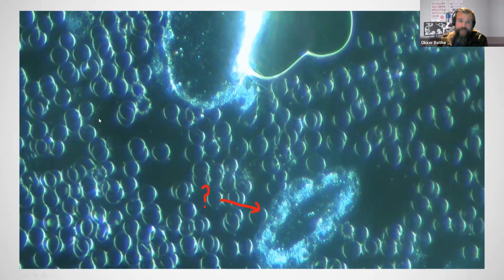We can see some patterns and some blotches in the background. Often there would be interesting and important things that we would be able to see, but with this level of clarity, it simply isn't possible. You can't see much in the plasma at all, can you?